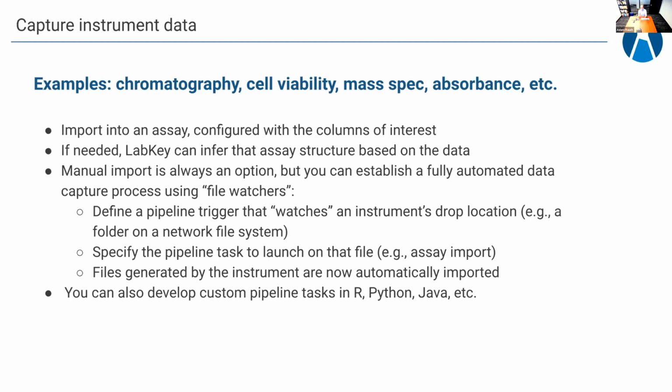You then specify a pipeline task to launch on the files that match what you want to import. In this case, we'd specify an assay import as a pipeline task. With that set up, all the files generated by that instrument are automatically imported into Biologics whenever they appear.